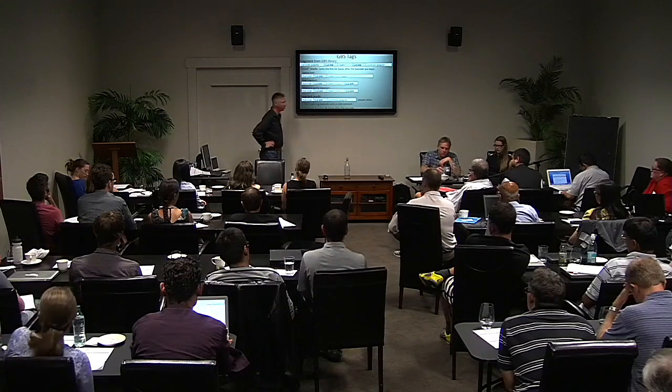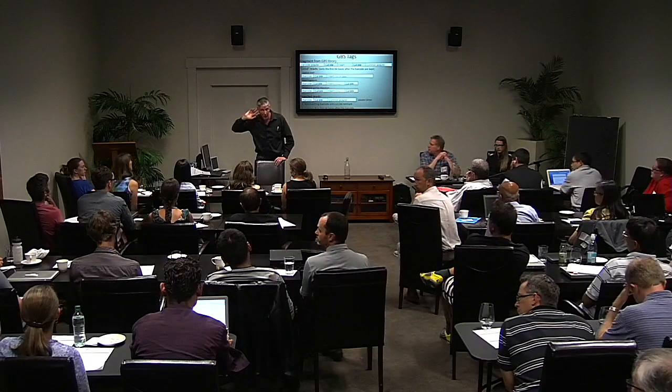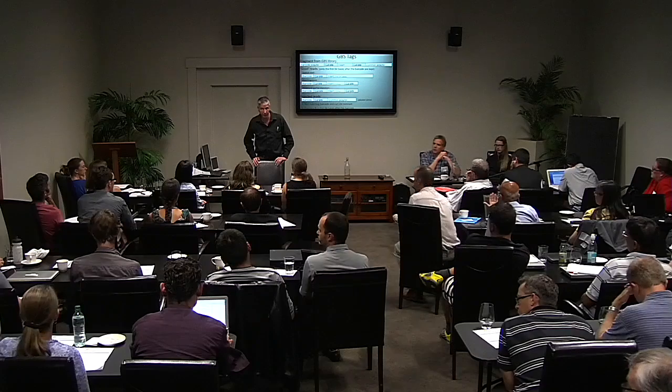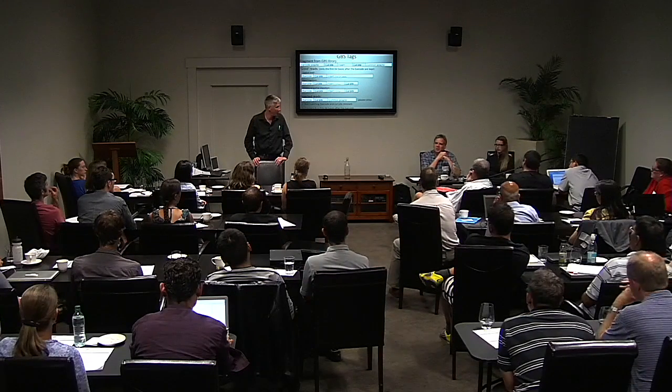Rob, sorry, can I just ask another question? How short is too short? Because you're keeping ones that are less than 64, right? Yep. So how short is too short? It depends on the species. When they get really short, they become really repetitive, so then they're not really useful for calling SNPs. Around 20, something like that.